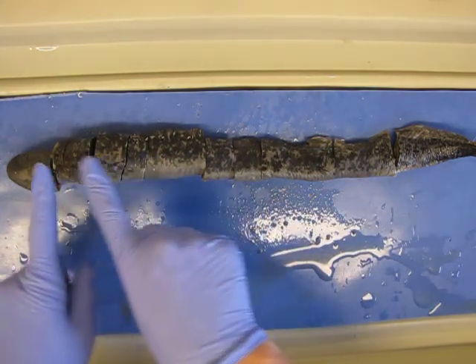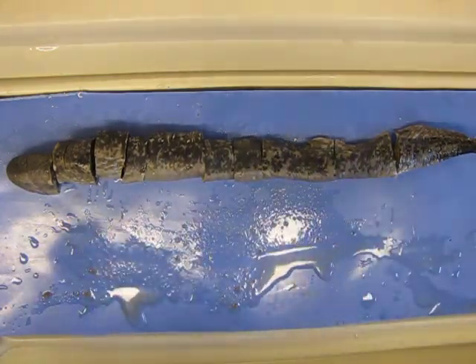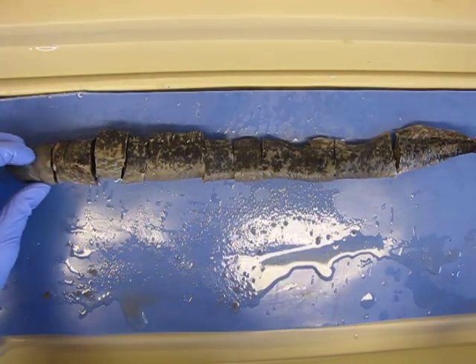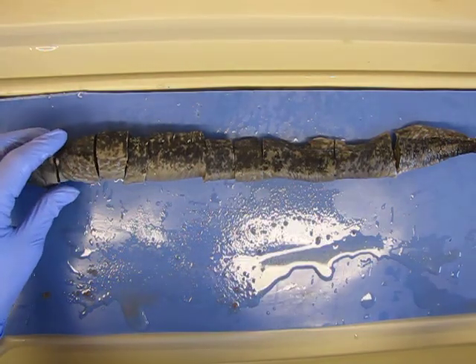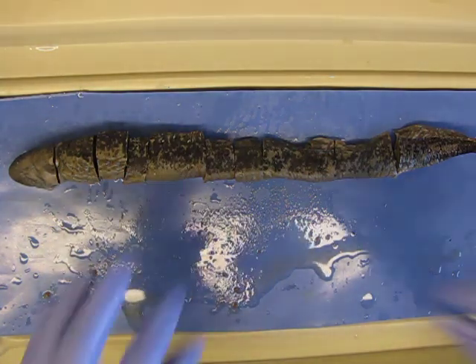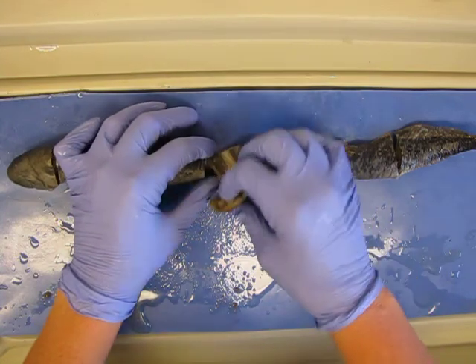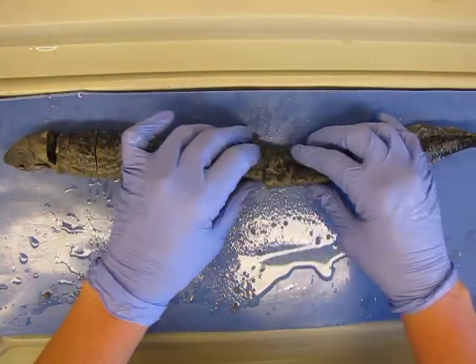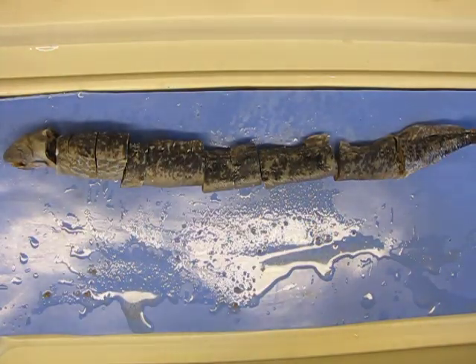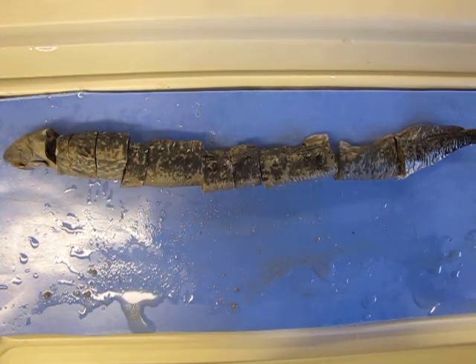Here you can see I've done several sections on this full lamprey, and then we will take them all individually. It happens that this one is a male and the sagittal section was a female, so that works out pretty well. We'll be able to see what the testes look like, and I did a couple of sagittal sections within the cross sections so that we can get a better idea of what the testes will look like on sagittal section too. So I'm going to zoom in a little and then take each section at a time.